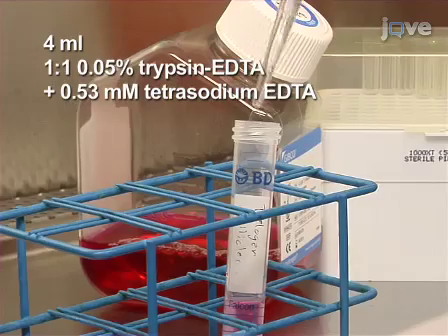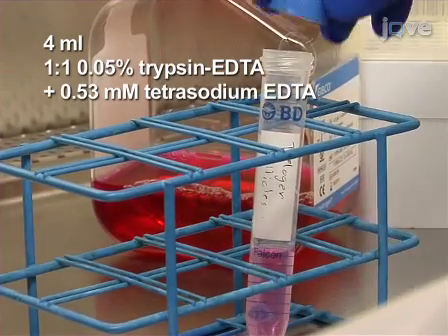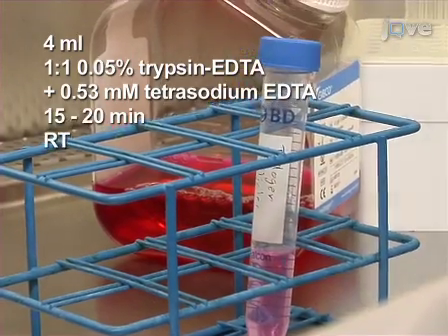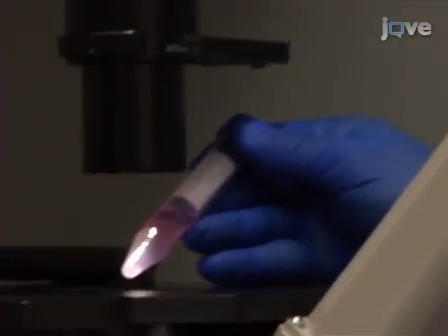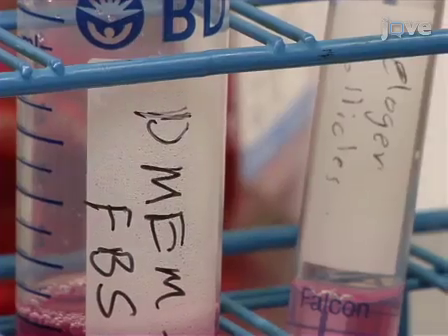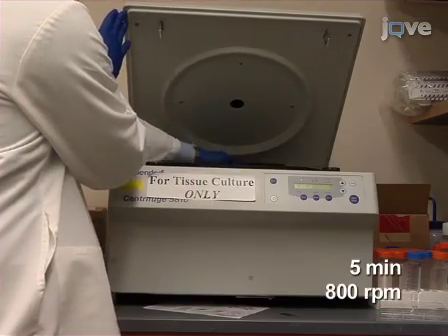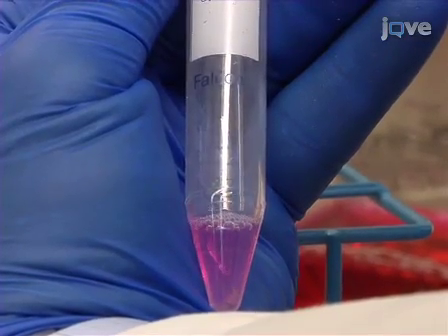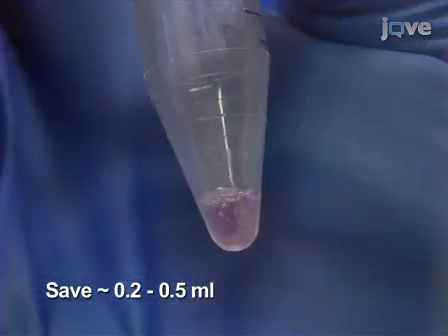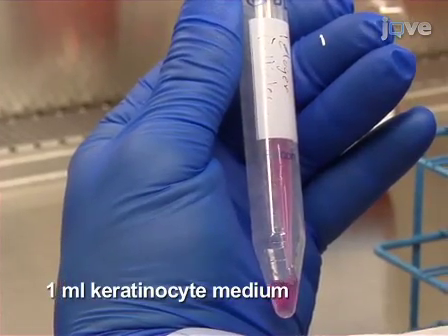Then add 4 milliliters of a one-to-one solution of 0.05% trypsin-EDTA and 0.53 millimolar tetrasodium EDTA for 15 to 20 minutes at room temperature. Shake the tube periodically to mix. Detached cells can be visualized under a dissecting scope to monitor progress of digestion. To stop the digestion, add 4 milliliters of DMEM plus FBS and centrifuge for 5 minutes at 800 rpm. Discard the supernatant, carefully saving approximately 0.2 to 0.5 milliliters to avoid losing cells, and resuspend in 1 milliliter of keratinocyte medium without EGF.